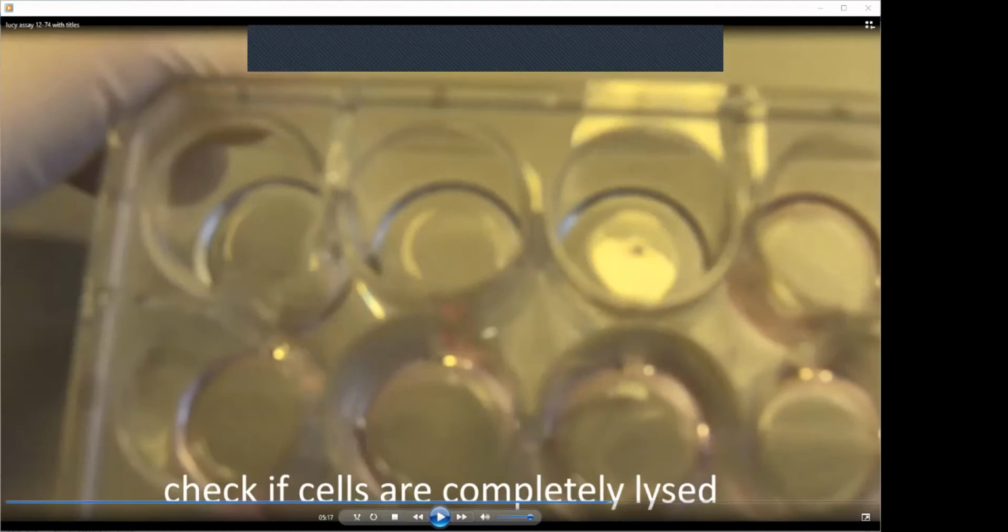In the meantime, you can check your samples which were rotating at room temperature, to see if they are lysed. And that has to be complete lysis. How can you see that? If you hold this against a dark background, you see that there are clumps of cells, so they peeled off the plate. You have to play a little bit against the light or against the dark background.